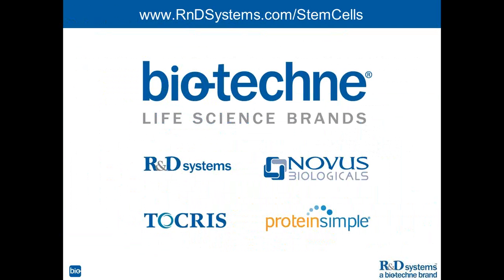So really what you would want to be profiling is likely the culture media from your cells, so looking at profiles of what is being secreted from these cells that you can detect, like I showed, insulin and albumin and things like that are the same type of things that you can detect with Luminex. It is possible to look at cell lysates as well, would be another option, but you wouldn't be looking at an actual whole or live cell. Okay, I think that clears that up.